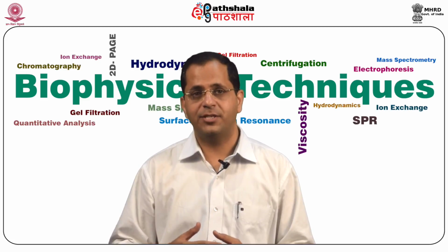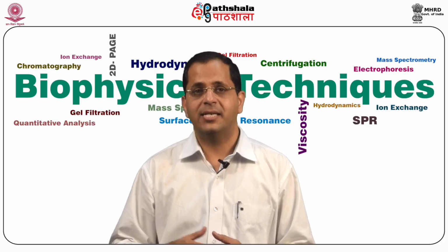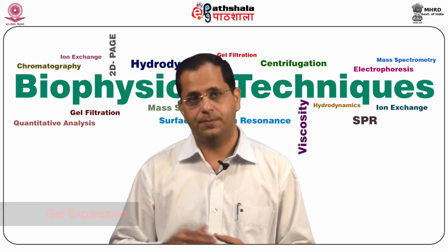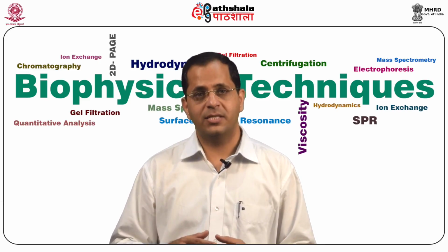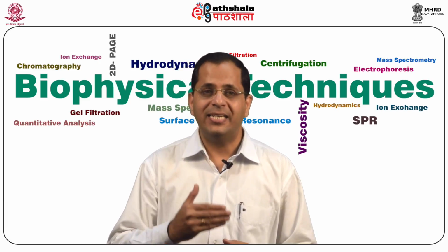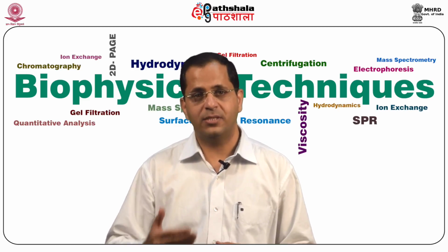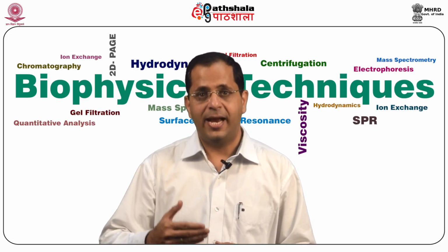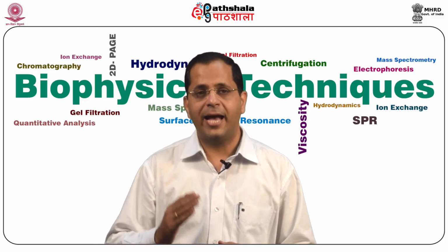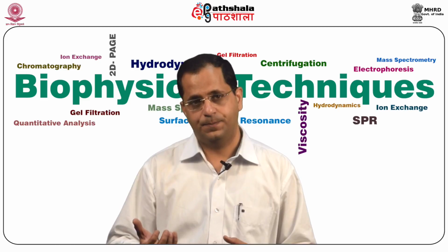Modifications of two-dimensional electrophoresis. This is what you call differential in-gel expression. 2D fluorescence difference gel electrophoresis uses an internal standard. So, the samples can be subjected to the same experimental conditions and can be easily compared and accurately quantified for different protein expression.